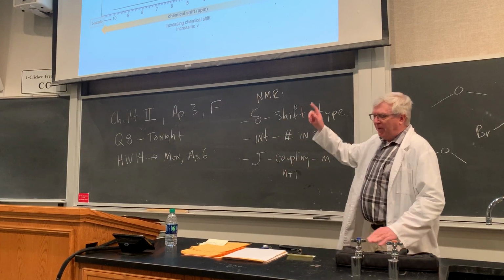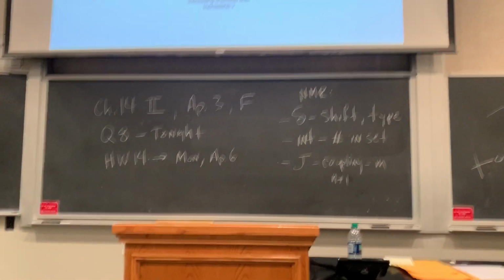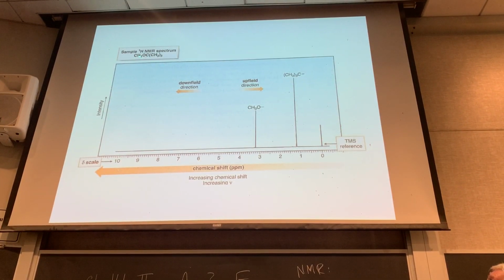So our first graphic up there, to get you highlighted here, what we're looking at is tert-butyl methyl ether, the formula shown there. Well, it's a structural formula. You see the tert-butyl and the methyl are on the ether here. And you see a singlet at 3.2 ppm for the methoxy group, that methyl there. And the methyls on the tert-butyl are all the same. They show up as a nice singlet right here at 1.2.